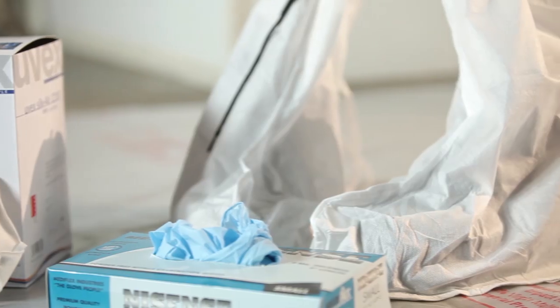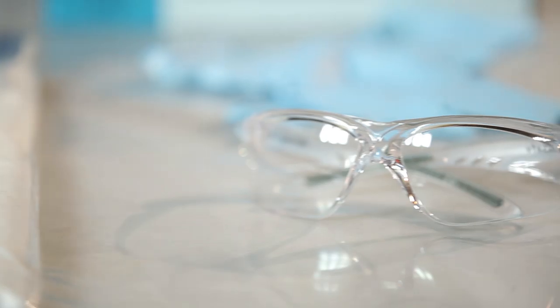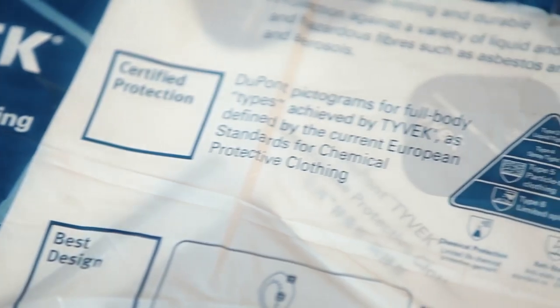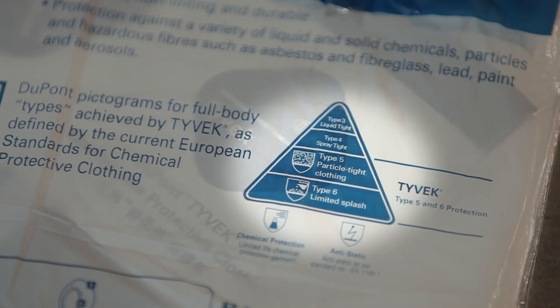Completing a risk assessment will help you choose the right PPE for the task. It will determine whether you need to wear items such as boot covers, disposable coveralls with a hood, a respirator, eye protection or a face shield, and gloves. The rating of the PPE you need to wear to complete the task is critical. Certain items of PPE, such as respirators and coveralls, are rated depending on the hazards they protect you from. If you need to wear PPE, you must be trained and given instructions to know how to use it and dispose of it properly.